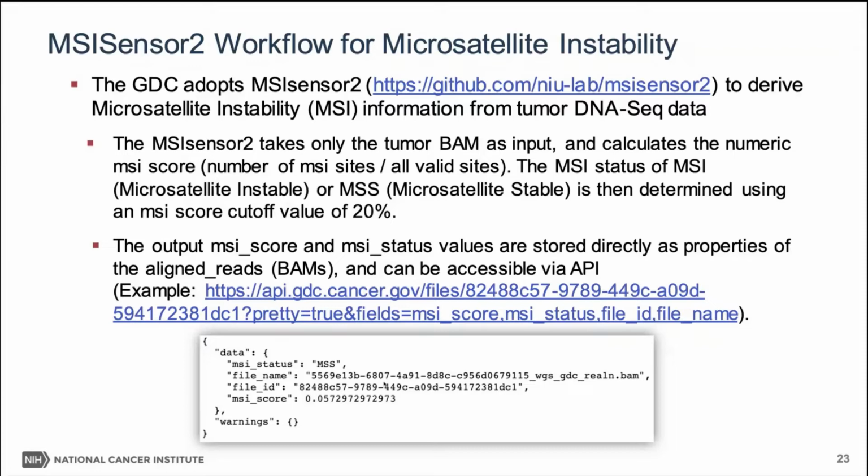And sometimes, in very rare cases, you see inconsistency between those files, or inconsistency between the file we have derived and what the clinical lab have derived. It could come from different reasons. One common reason is we probably use different samples.